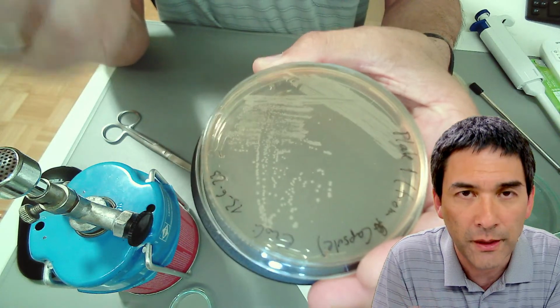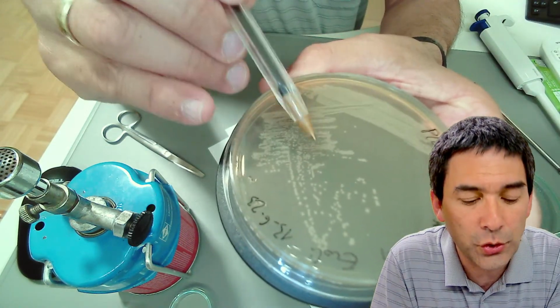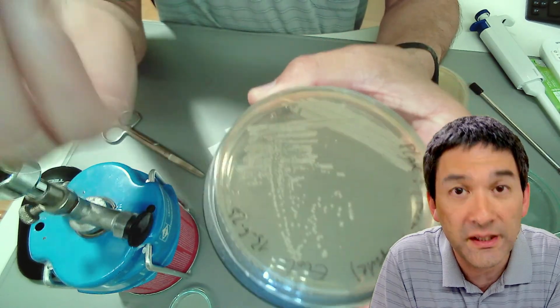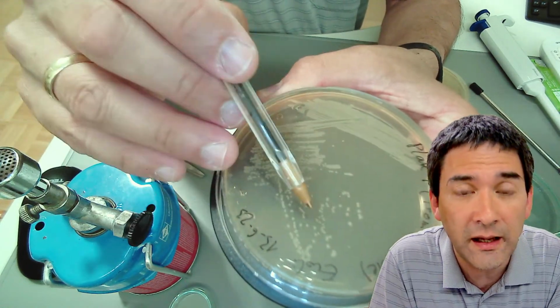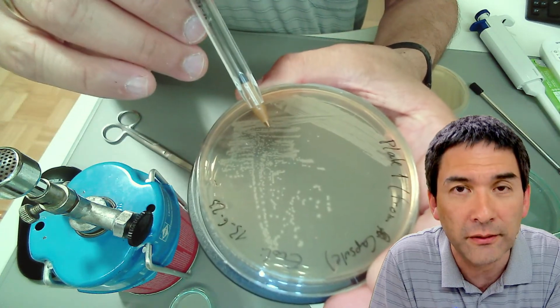And this is a very important standard procedure. The reason is that by looking at it now, I'm able to see that those colonies all more or less look the same. They have the same color, for example, and therefore I can assume most likely I have a pure culture, which means that I only got one type of bacterium.